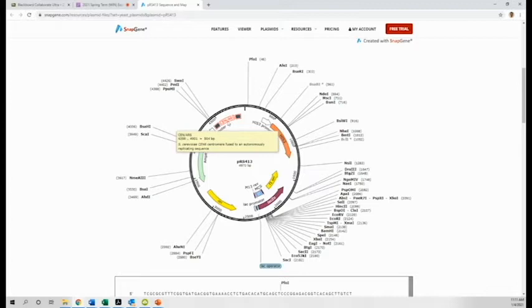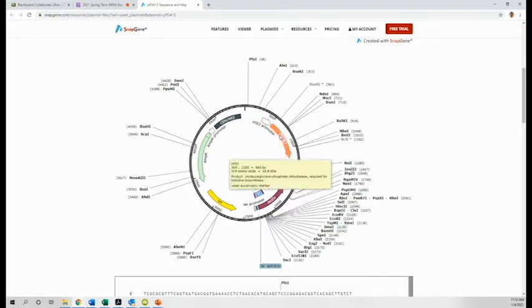You can see here the centromere sequence and the autonomously replicating sequence, the CEN/ARS, a centromere fused to an autonomously replicating sequence, so that you can duplicate the plasmid. And then we have the HIS3 promoter and the HIS3 gene here. Did you all see this plasmid now?